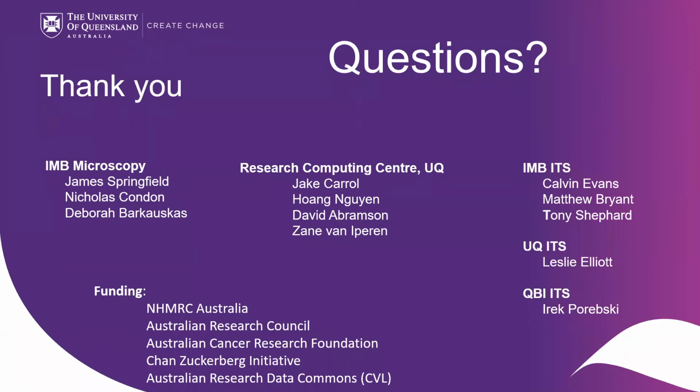PG has been born out of CMM activities, so I'm glad to see that others can benefit from the Clouder install here. And I think as a community we try just to push it. I can't tell you which software package will be the next one we will be working on, but we have segmentation as one of the highest priorities for volume imaging, and single particle processing for cryo-EM.